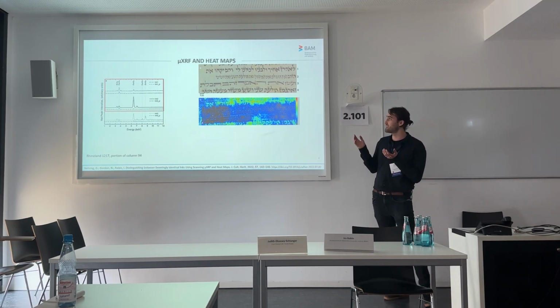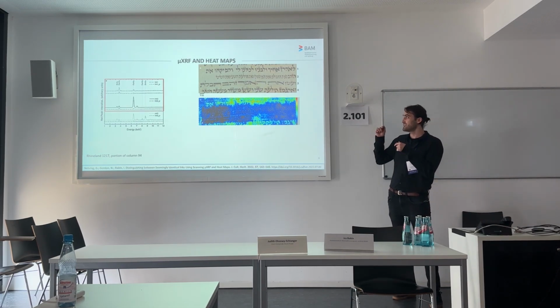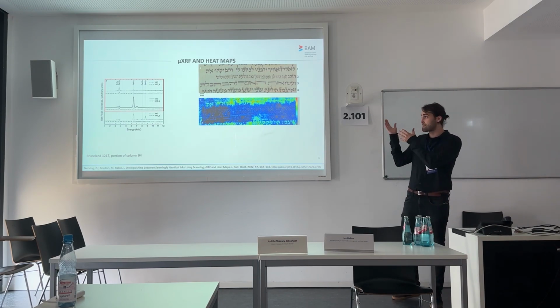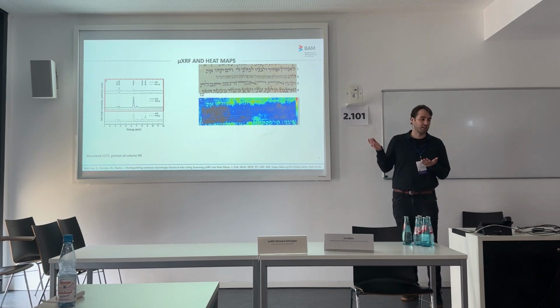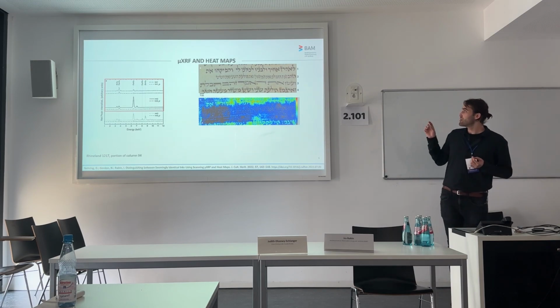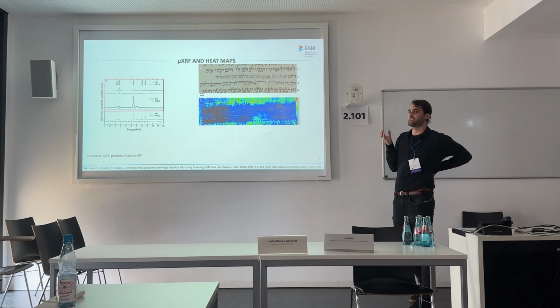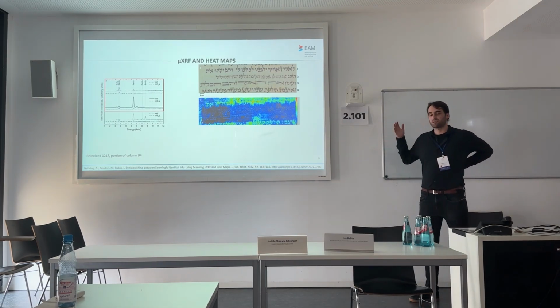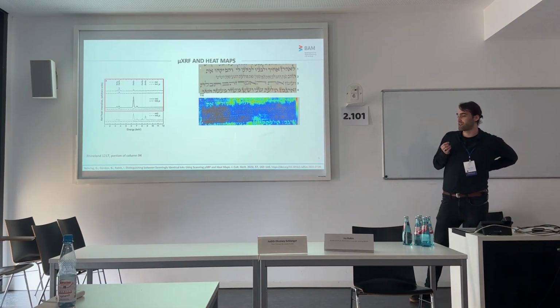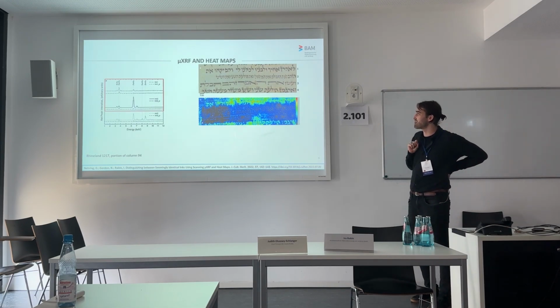By heat maps, I mean that where the signal is stronger, the abundance of an element is higher. The color in the map displayed is warmer, and in contrast, when it's darker or colder, simply there is less of this element. If we look at the areas between the second and the third line, we clearly see that the calcium has been removed from the substrate, which fits well with the different handwriting of those two lines, the second and the third line.